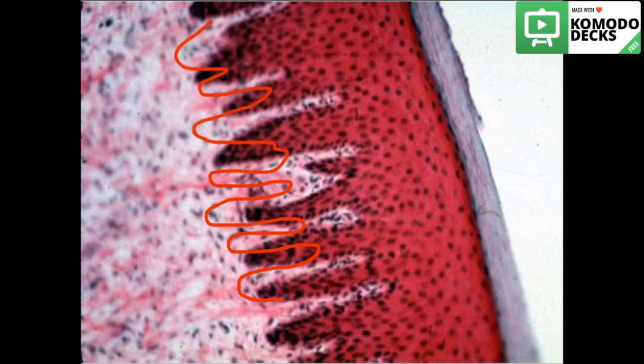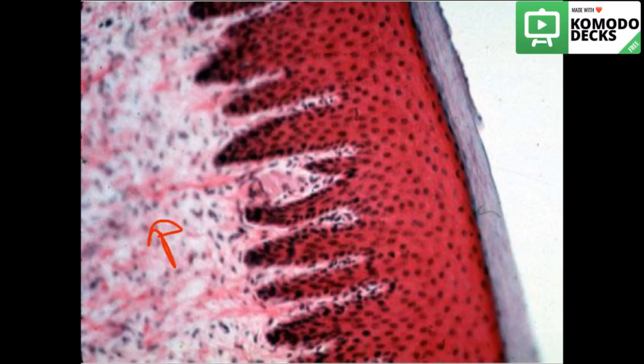A section of keratinized epithelium with the full layers, keratinized, granular, and spinosum. We see the rete ridges and the connective tissue papillae. This part is the connective tissue papillae, and down is the reticular part of the connective tissue.